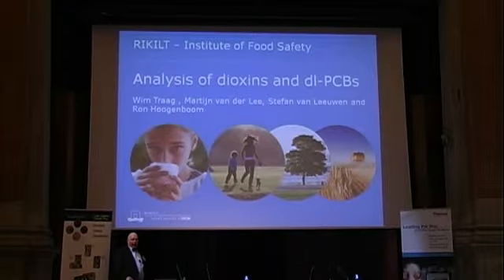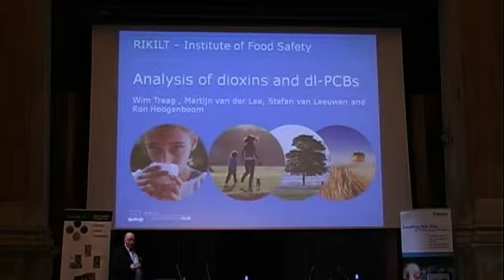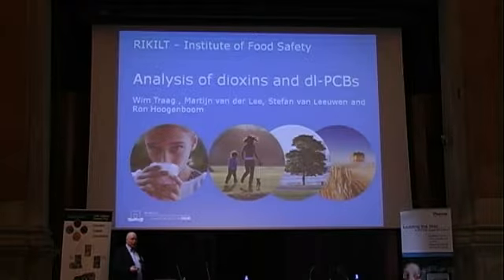Our approach at the Institute is that we use the bioassay for all our monitoring programs. We use the bioassay CALUX as well as high-resolution mass spectrometry. We don't use the bioassay as a quantitative approach. We use it as what you might call a semi-quantitative approach. We use it mainly for the selection of the negative samples from what we call suspected samples, not positive, but suspected samples. And the suspected samples have to be confirmed using high-resolution mass spectrometry.